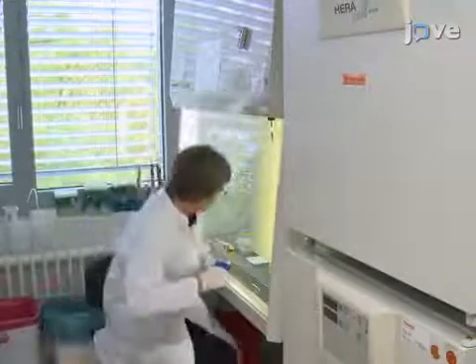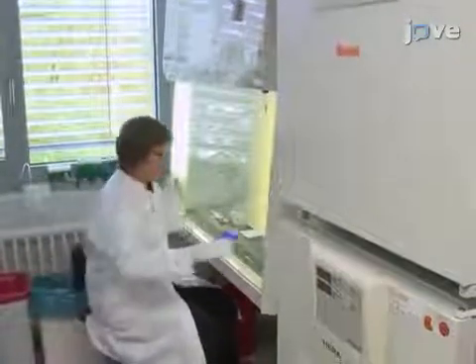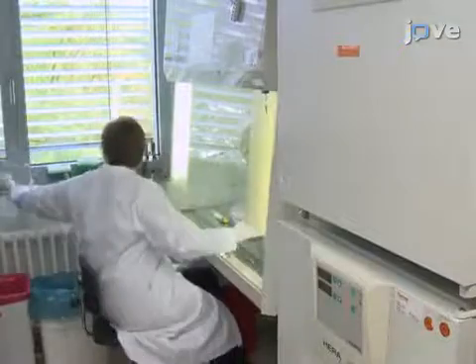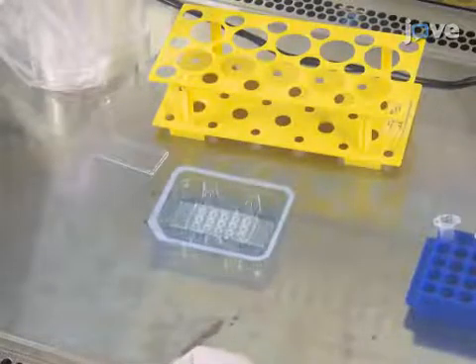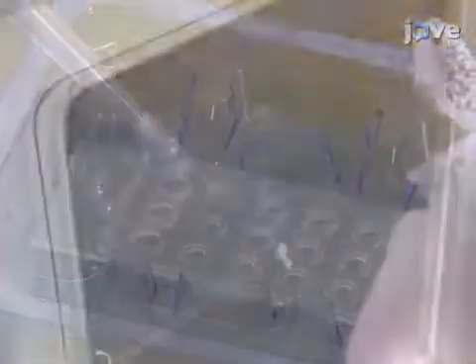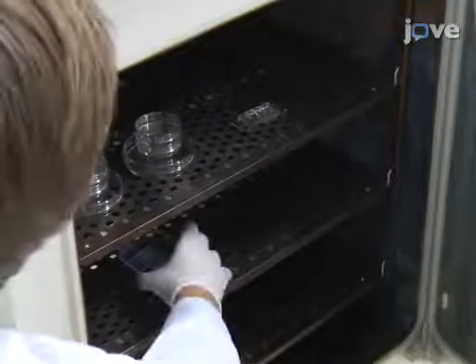To set up the plates, first add 20 µL of freshly made α4β1 integrin solution into each well. Plan for one allantois per well. Do not deposit any solution with air bubbles, as this will prevent proper coating. After loading the wells, incubate the plate for an hour in a humidified incubator.